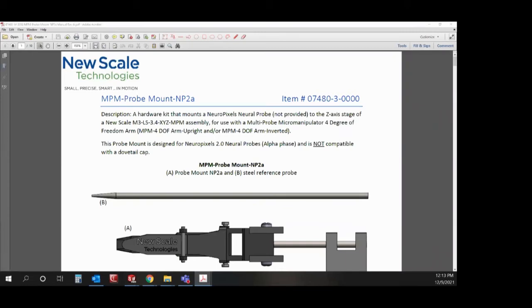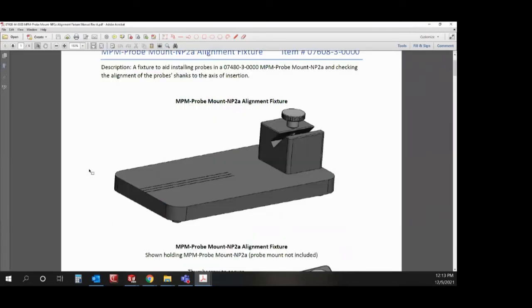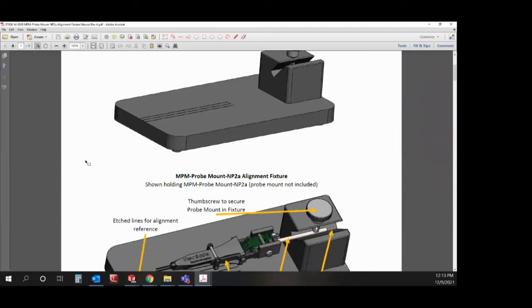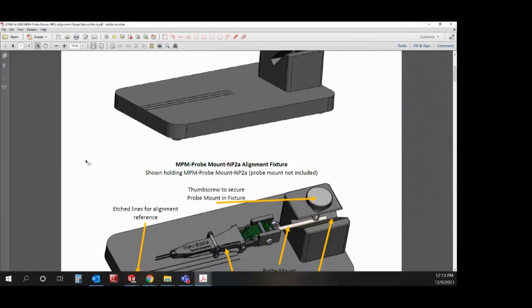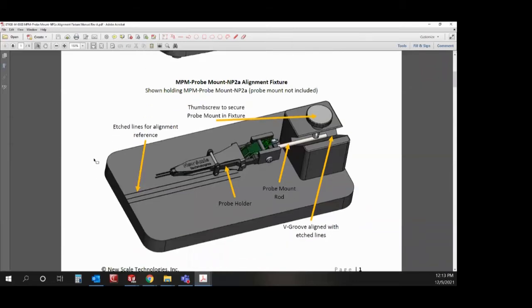And for the alignment fixture. We created this alignment fixture to aid in installing the probes as well as checking the alignment of the probe shanks with respect to the insertion axis. This is the rod that would be removable from the probe mount base.